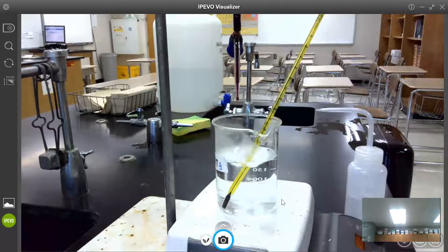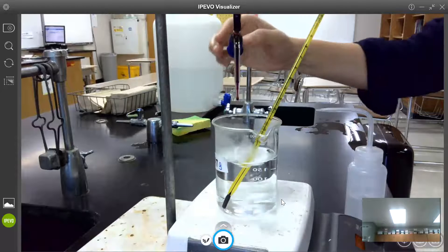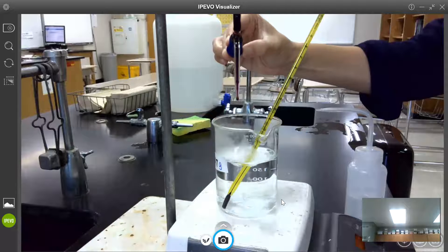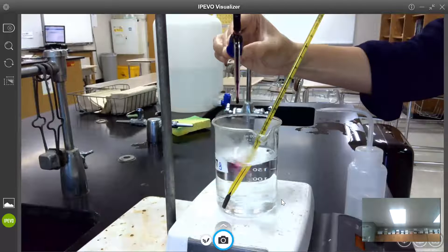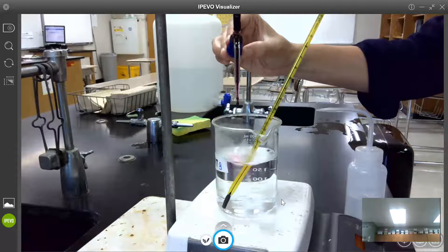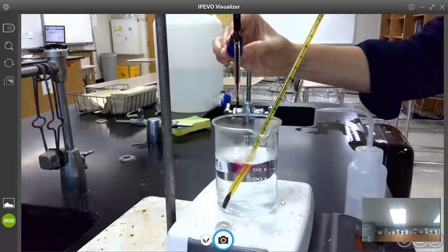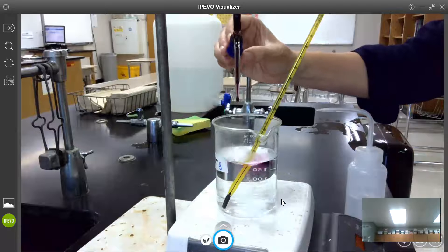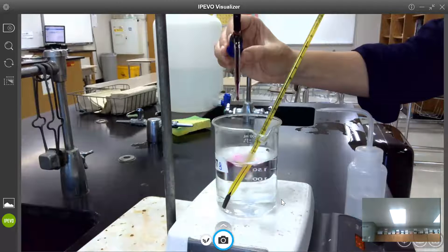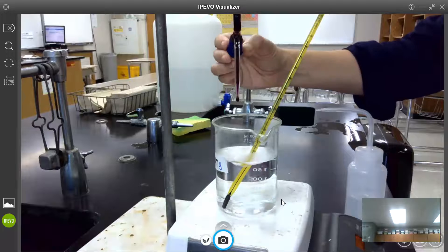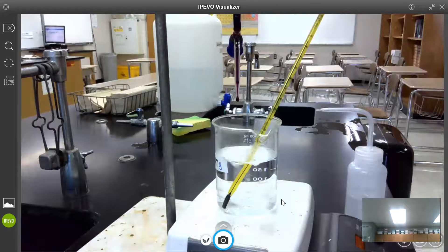So you can still see that the color has not persisted and so I'm going to add some more and now I get a little bit more cautious because I'm probably approaching stoichiometric quantities of the two amounts and I can see that that color is persisting just a little bit longer when I add it. I'm at 43 milliliters and I'm going to stop it and you can see the color is gone.